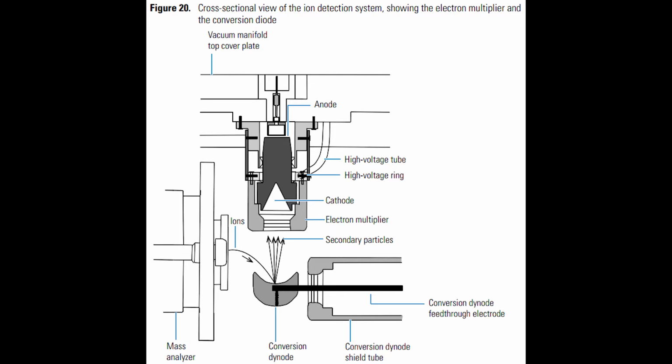That's still not enough. Then it's going to fly into the electron multiplier, which does exactly what it says it does. It's a series of plates, and each of these plates has high voltage on it, and when an electron impacts one of these plates, you'll get 2 or 3 electrons off. So if you put these plates in series, you can take a few electrons and convert them into a readable, useful electrical signal. You put a few electrons in and you get a lot of electrons out. That gives you a lot more signal, improves your signal to noise, and makes everything easier to detect.